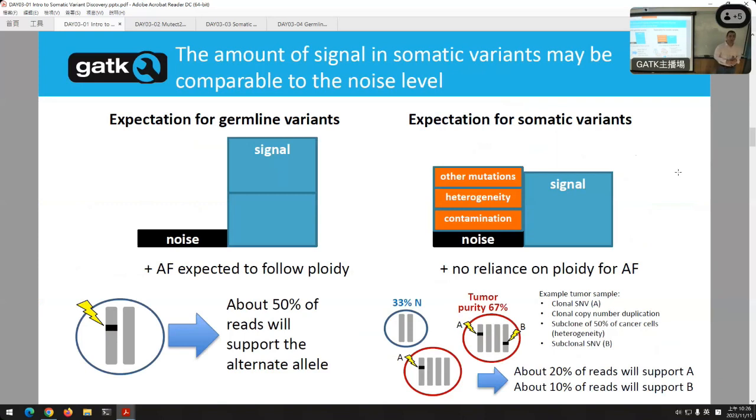And it's also hard because you have different frequencies, or fractions. Usually when you talk about an allele frequency, that's in a population. So if 2 people have a mutation out of 100, your frequency is 2 in 100 in the population. We talk about allele fraction. That's the percentage of your cells that show a particular tumor allele. And that's what's shown on the bottom there.